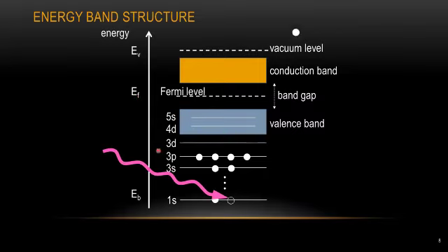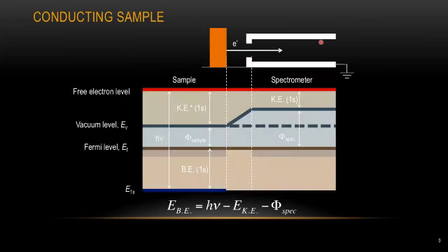This slide shows we still have the same process, and the electron will be leaving the atom and going beyond the vacuum level here. To measure the binding energy of our sample, we can draw a schematic of the reference energy levels and physically align our sample and our instrument. In the picture on top here, the orange color is our sample. Assuming we are creating the photoelectric process, the electron will be leaving our sample and going straight into the spectrometer.